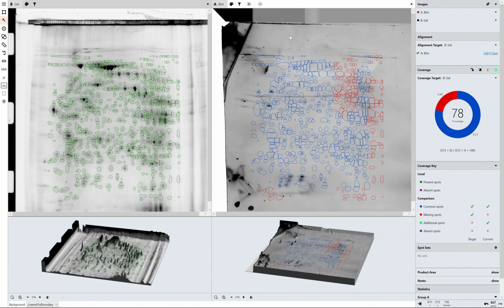if you can reliably, consistently use the automatic spot detection, that's going to give you much more consistency between your results and give you much more rigorous data. We can see that within our SpotMap software, we give you an exact coverage percentage. We don't give you a range. We don't have the concept of something being not a spot, not present or not absent, this kind of gray zone that maybe other software has. We give you a definitive score based on the work that you've done.